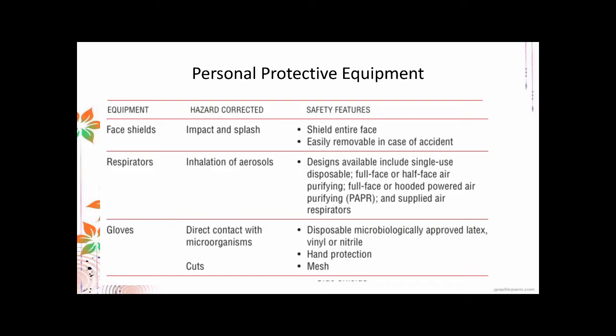Anyway, face shields. Shields the entire face. It's easily removable in cases of accident. Actually, face shield has been well known to us right now, because with this pandemic, we are using face shields as well as masks whenever we go out.